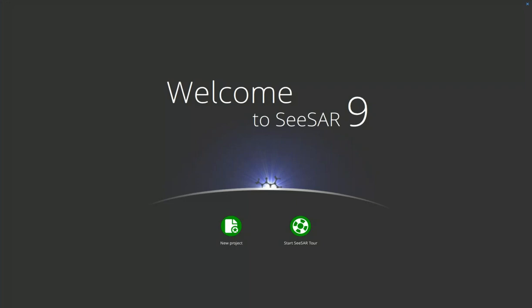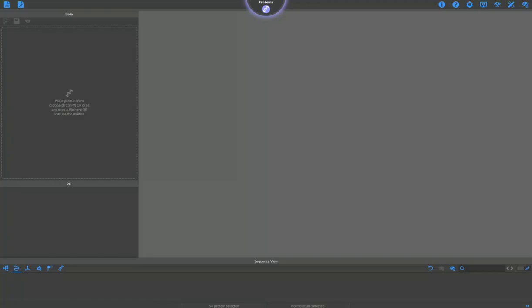As I've seen that most of the people are rather in the early stages of SeeSAR experience level, I will start at the beginning. I still hope that the frequent and professional users find some of the new gems inside it. So I will start with a new project today.